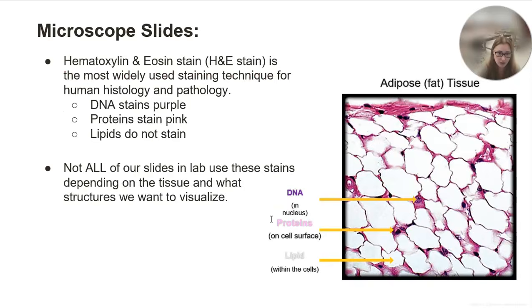The last bit I'm going to talk about here is staining. Tissues, when they come from the body, we typically cannot take the tissue, plop it on a microscope slide, and we're good. We can see what we need to. Typically, we're going to have to do some sort of staining process. And staining here, as you might imagine, just means we're going to add different dyes to the tissue that certain parts of the tissue, certain molecules, are going to grab onto, and that's going to make them more colorful. Makes them easier to see.